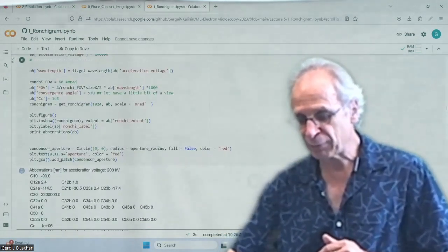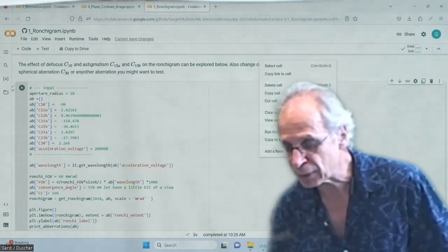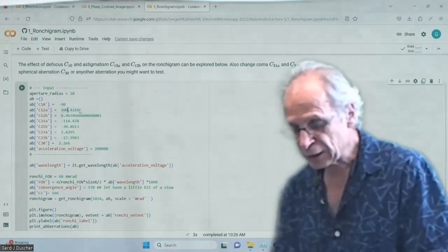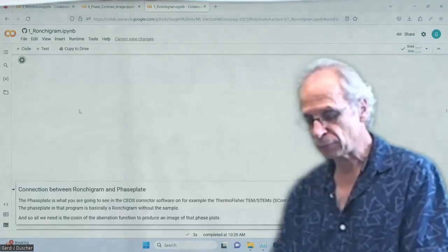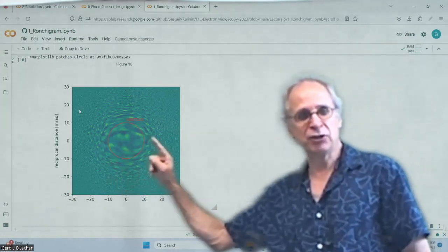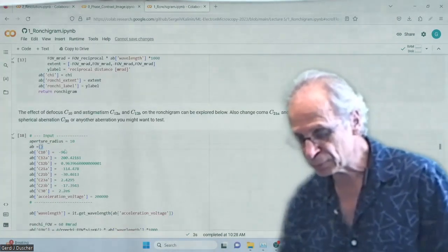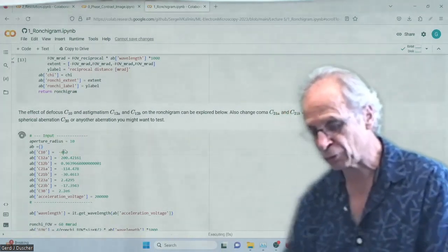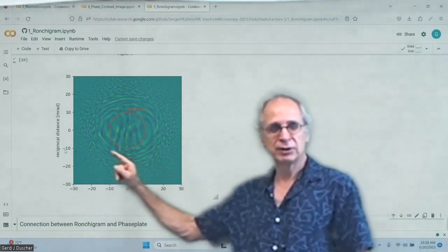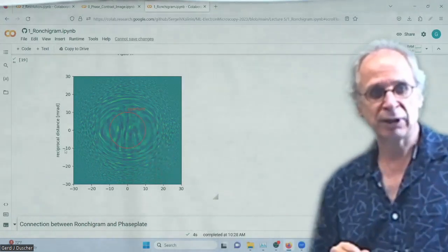How does it look if you have some astigmatism? That is what we first do. So let's put, where's my mouse? In the A direction, let's put 200 nanometer of astigmatism onto that. So we have clearly a change here, right? So we have something that is changing our Ronchigram. If we go a little bit more in defocus, change something to a few hundred in the defocus value, then you can see this oval structure with a lot of things in between that are streaky. So very clearly a strong astigmatism.